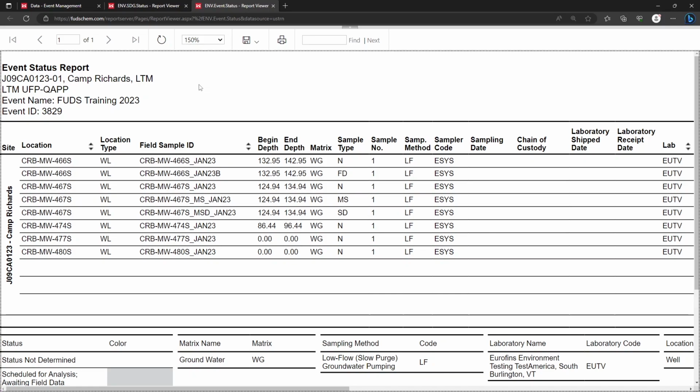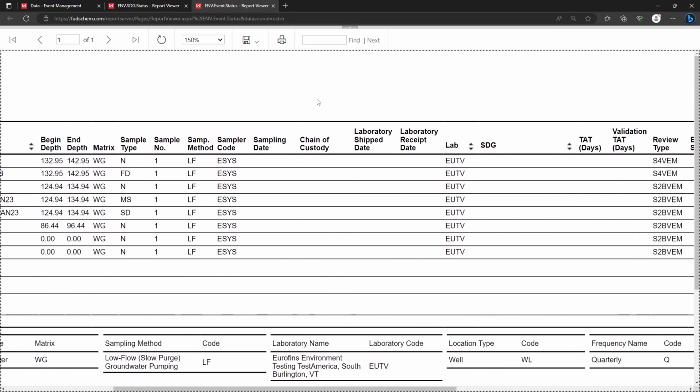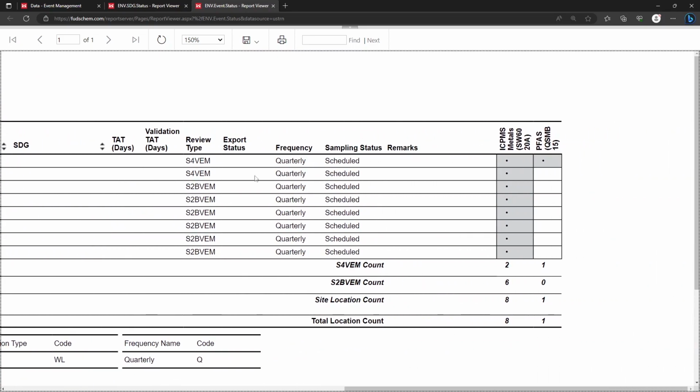Marking the review level here means the chemistry detail report will display counts for each review level. This will easily allow us to show our client that we met our goal of providing higher level review for at least 10% of the data. Let's go back to the interface.